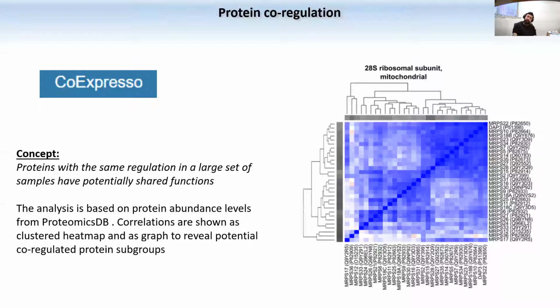Right. Now, let's say, for example, that you know nothing about how your proteins are interacting with each other. Let's say that you're working with a very strange organism, and you go on String, you paste your protein in that database, and no connector lines come up. So there's nothing known about how proteins interact with each other. How can you start grouping your regulated proteins in a way that starts to make some sense about which proteins potentially can have a similar function?